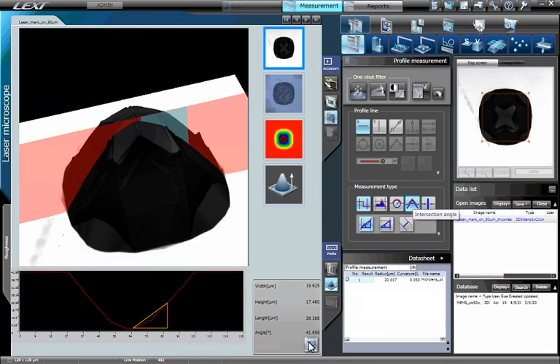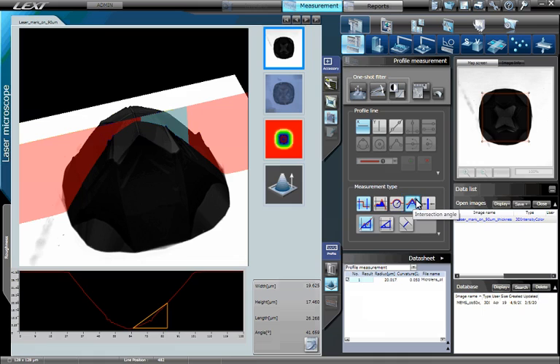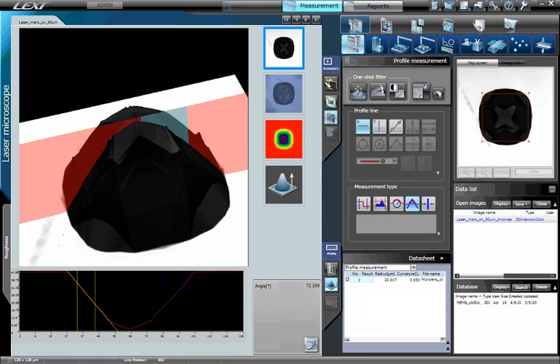The LEXT can also accurately measure an intersection angle via line profiling. For example, to measure the angle of intersection on the tip of this laser mark, select the button Intersection Angle as the measurement type. To accurately differentiate the tip from the outer walls of the laser mark, we need to zoom in on the graph.